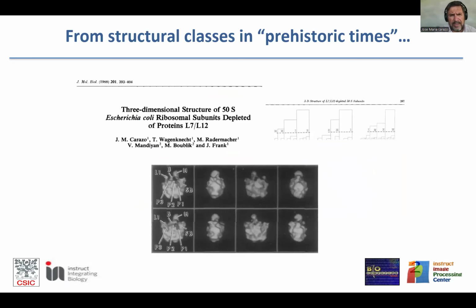Well, when did we start doing things like classification? You have a collection of images coming from a collection of macromolecules. You certainly cannot think that all of them are exactly the same, that there is no flexibility in the system. Normally, there is going to be flexibility. I am hesitant to say dynamic because the time information is not that easily captured.